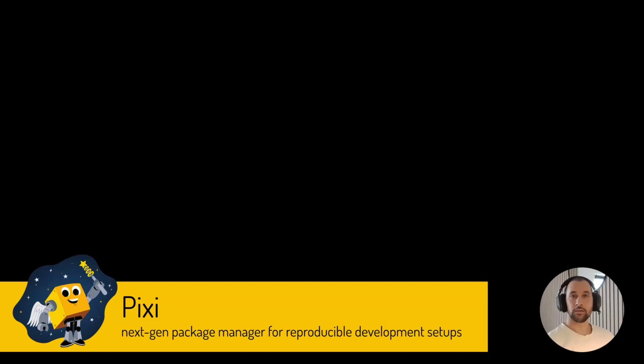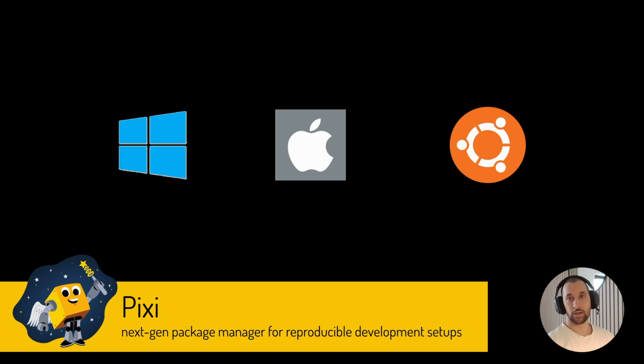Hi again. In this short video I will show you how to start using this image analysis pipeline with the help of Pixi. This will allow you to run your analysis on your PC regardless of the OS you're using. This pipeline has been tested to work in Windows, macOS and Ubuntu.